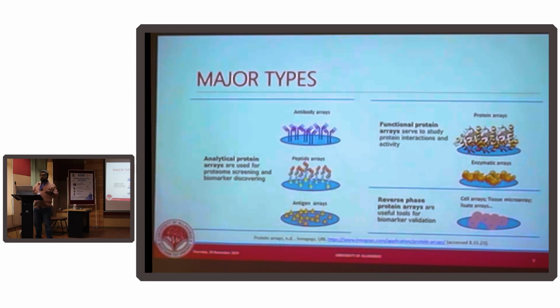If you have to do these individually, for these 60 proteins, it will be extremely costly, and forget costly, it might be extremely laborious, and then you would have variations, because perhaps for these 60 blots, it would take at least 4 to 5 months. Temperature conditions might change, your mood might change, your buffers might change, and the lysate that you took, after repeated freeze-thaw cycles, even that condition might change, right? So you can do it in one go, in one shot.